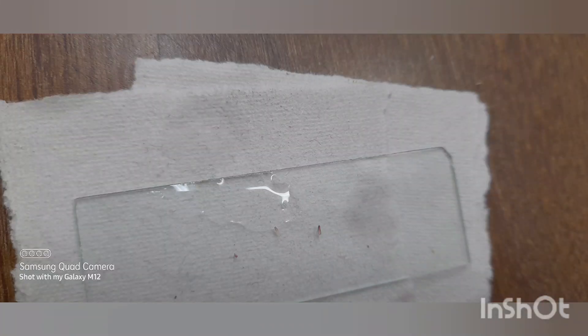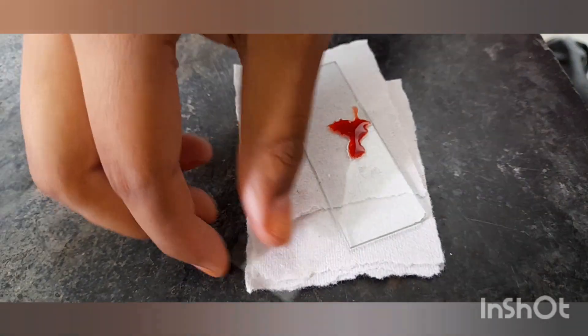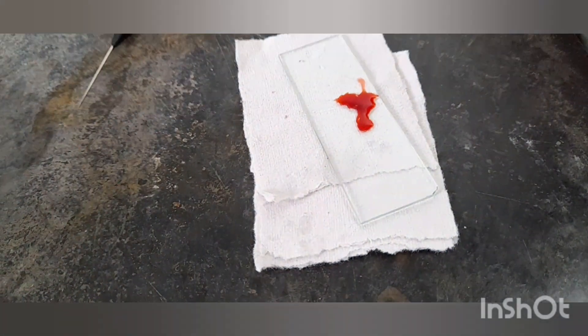Place the embryo onto the slide and add a drop of stain to it, then cover it with a cover slip. Add gentle pressure to the cover slip to ensure that the embryo is flattened and evenly distributed.